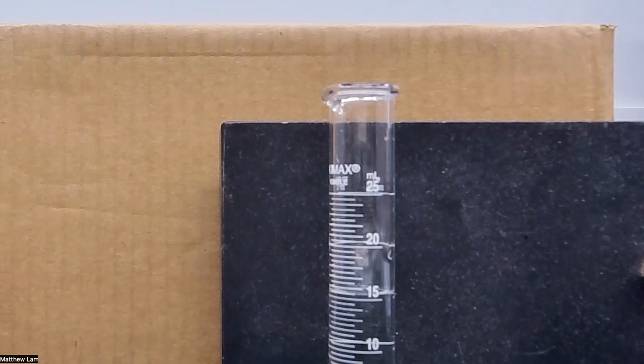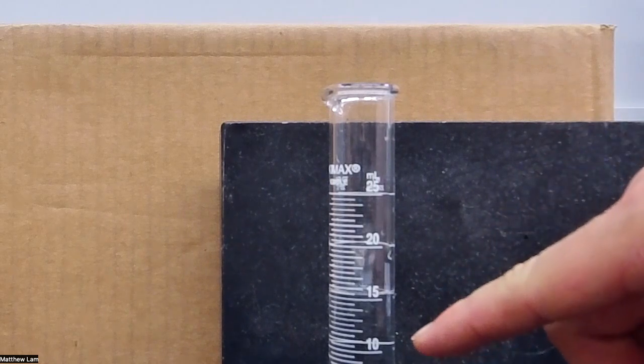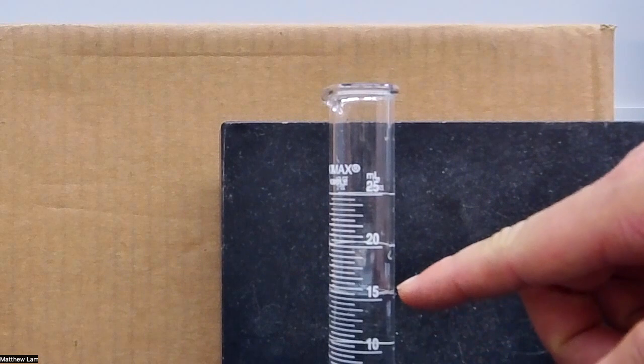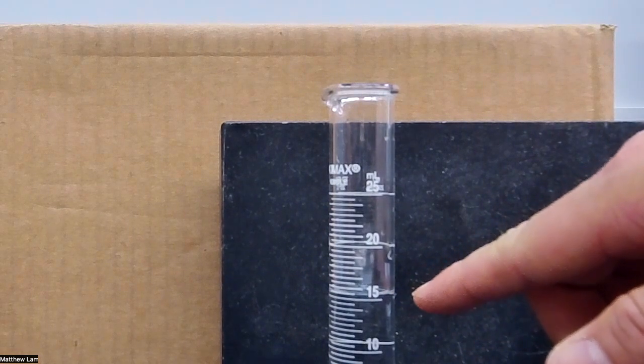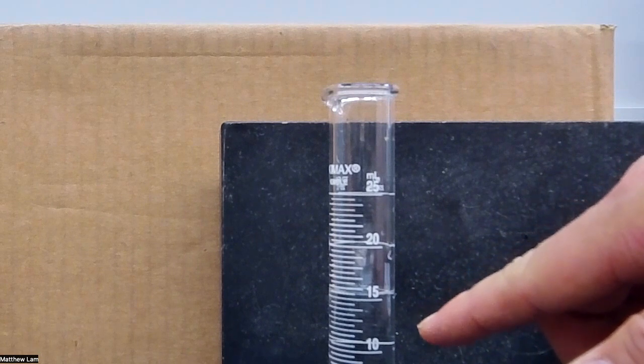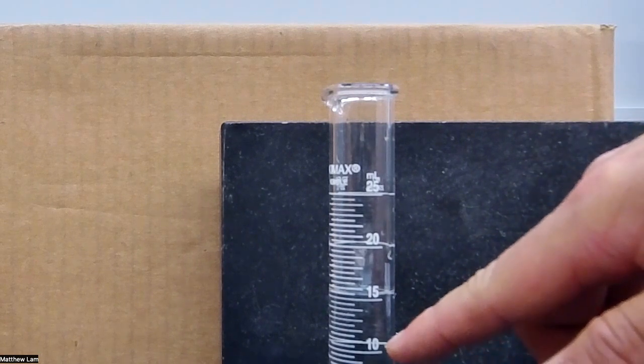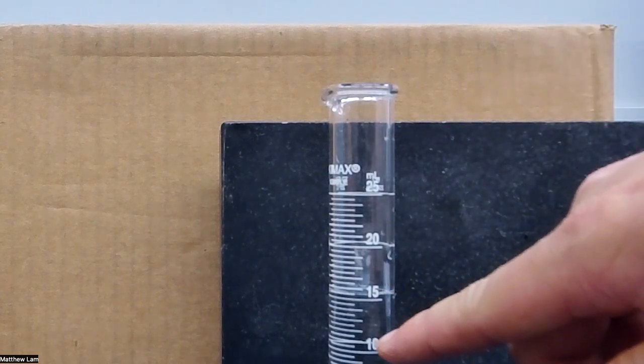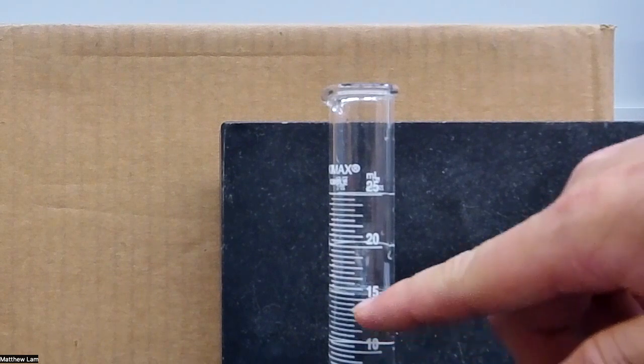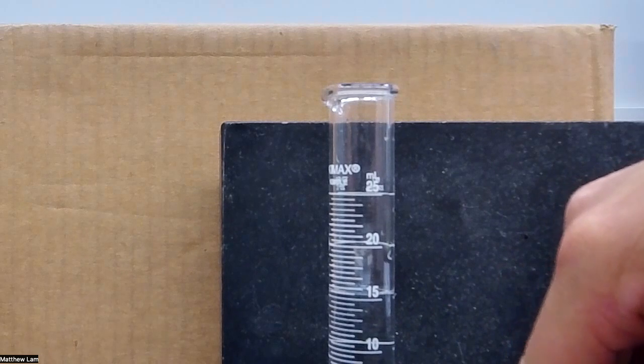Okay, so I put something black behind the graduated cylinder so we can see it a little better. As you can see, there's a volume of water in here. And we want to measure the reading before we add the Teflon ball in. So it seems like the larger ticks are every five mils, the medium ticks here look like they're every one mil, and the ticks in between are half a mil.